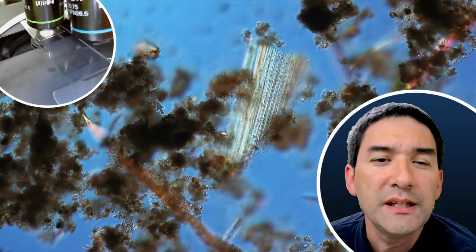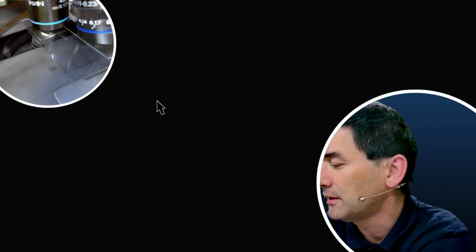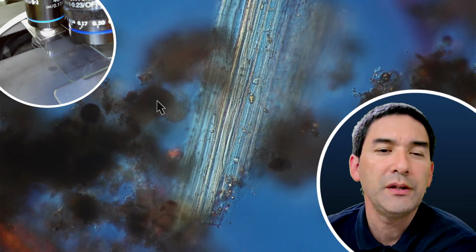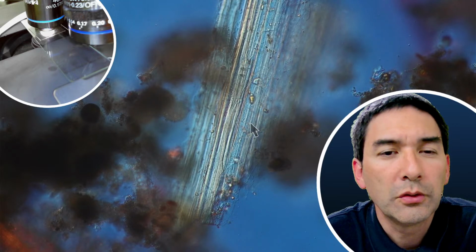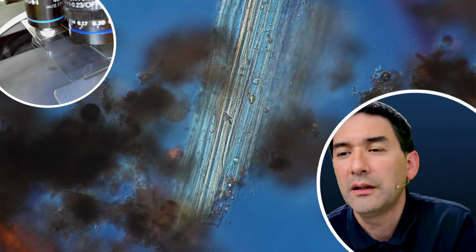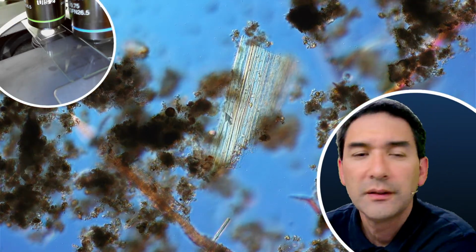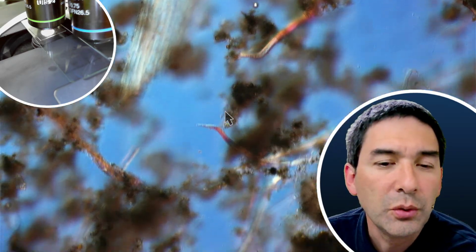Okay, so this here is, let's zoom in a little bit here. This is most likely some plant material or wood or something like that. What you're able to see here are of course the individual cells. Looks almost like in a longitudinal cross section here. So it's also nothing quite uncommon. Let's readjust. But again, a little bit surprising for me that there are not more.